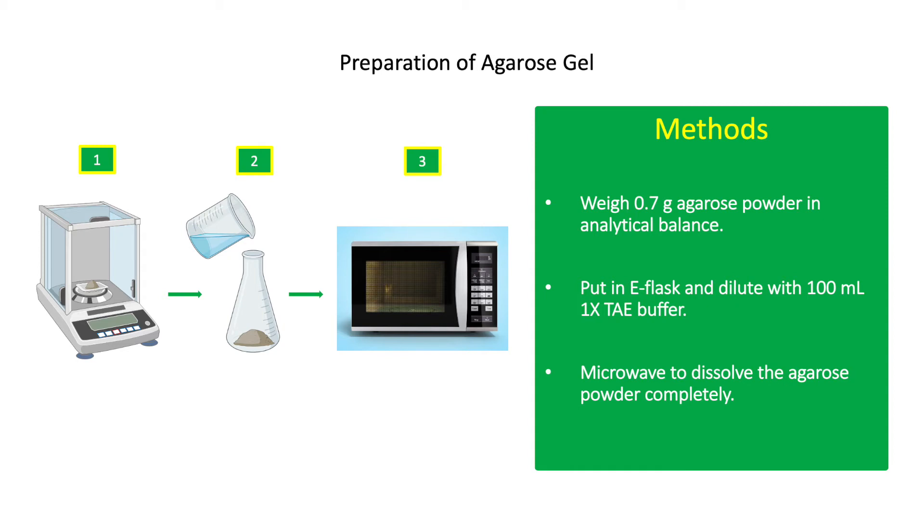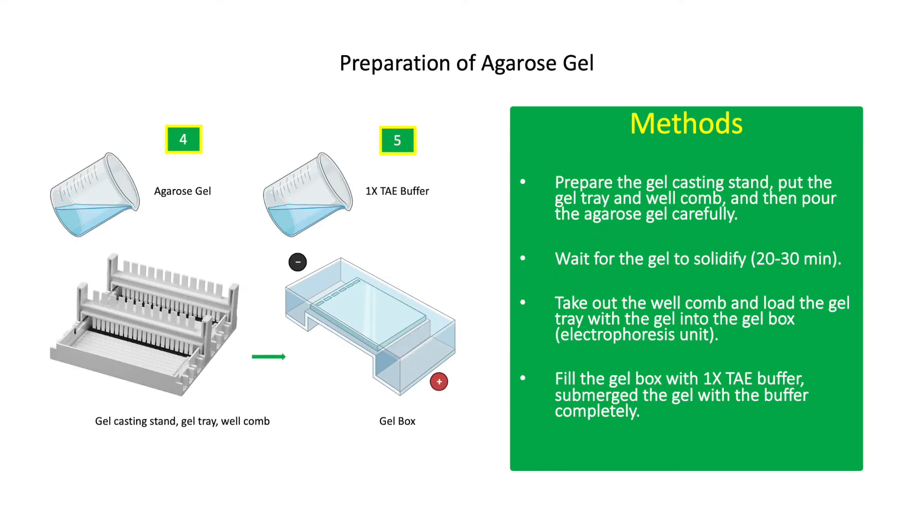Be careful when microwaving the agarose in the Erlenmeyer flask because it might overflow when it starts to boil. Always watch inside the microwave, and once there are bubbles, stop the microwave and shake the flask intermittently. Do this until there are no more visible agarose powder or bubbles in the solution. Then prepare the gel casting stand, put the gel tray and well comb, and carefully pour the agarose gel.